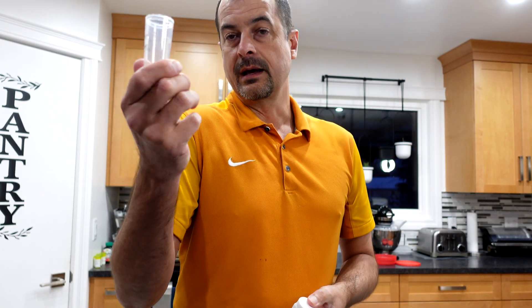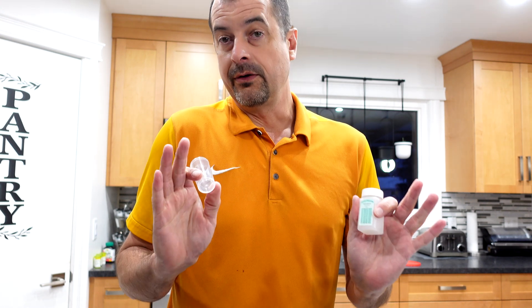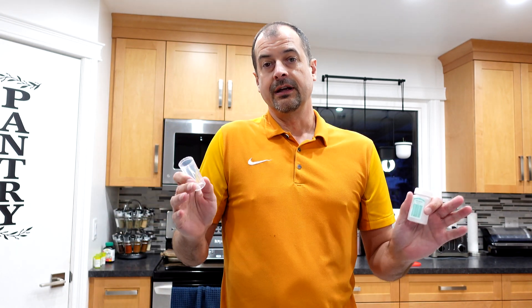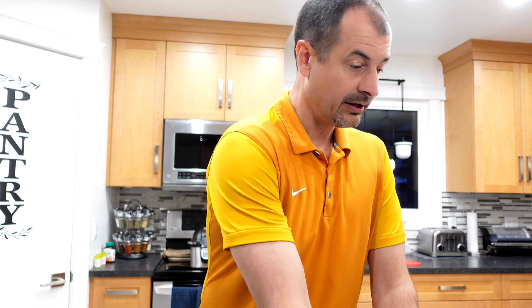You can fill this thing up about halfway in order to do so. Just a word of caution here — personal protective equipment, whatever you feel like you need to wear or whatever you think you should wear, you should do that.